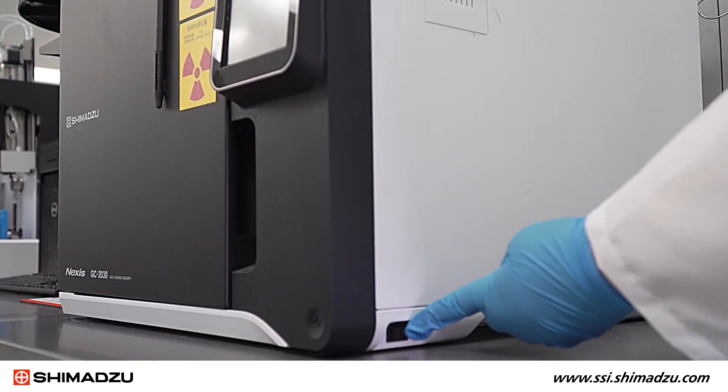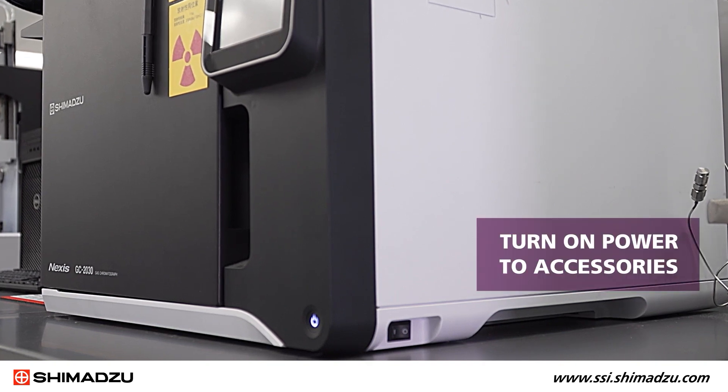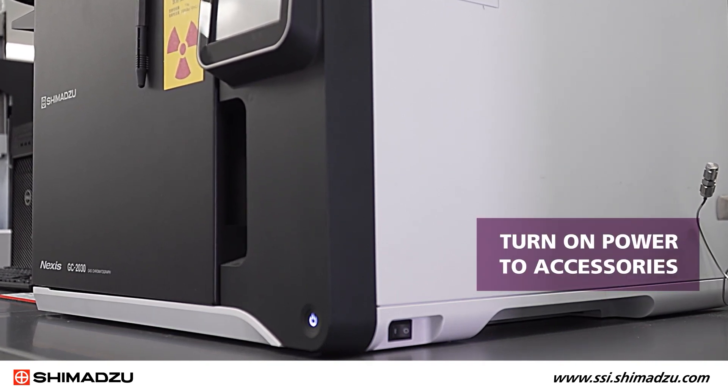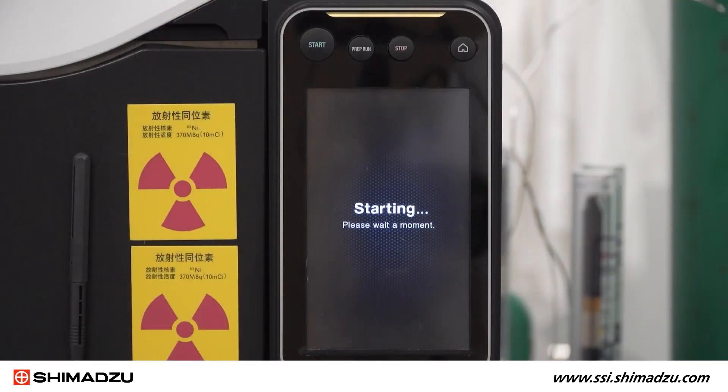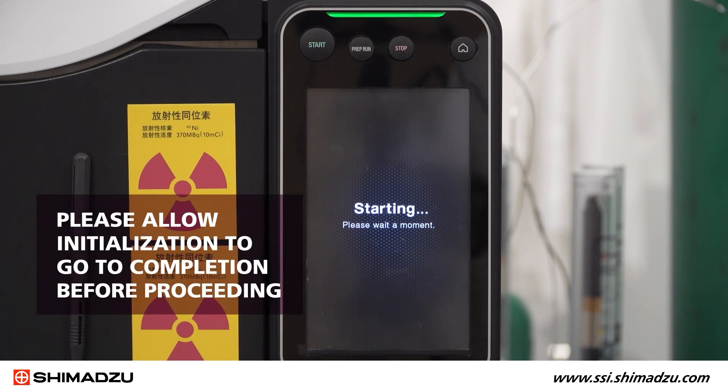Plug in the power cable of the GC unit and switch on the power. If accessories are attached, turn on power to those units as well. The system will go through initialization steps. Please allow initialization to go to completion before proceeding.